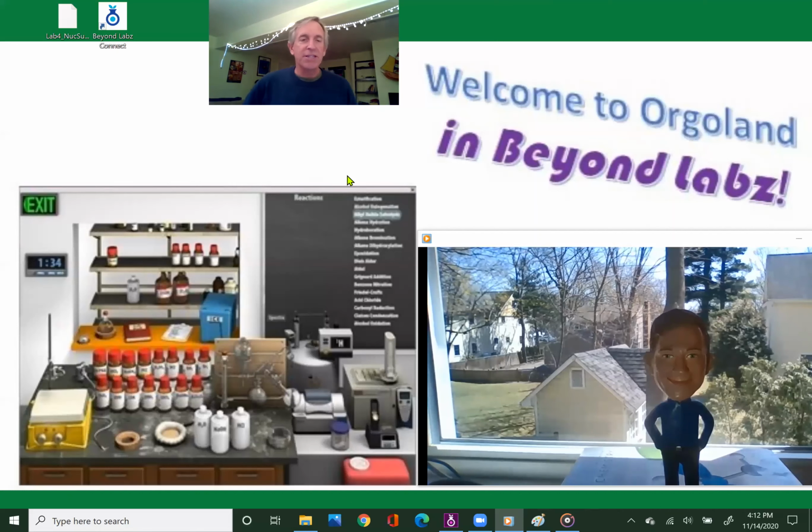This video is part of that. So feel free to speed it up, slow it down, look at it a couple times. But let me be very clear what this video is all about. This video is an introduction into Beyond Labs, not the techniques that are going to be used in the synthesis of organic compounds using this virtual platform, but basically just a brief tutorial on how to actually create an organic synthesis in Beyond Labs for our lab.